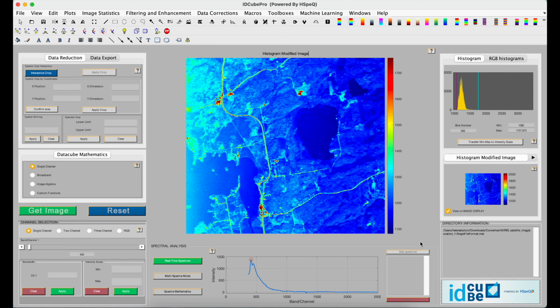You can scroll through the different components assigned to different color channels. Note, the default is the first component is red, the second component is green, and the third component is blue. It's important to also consider that the first 20 principal components can be assessed. And as you scroll through, you can see how the different components interact.